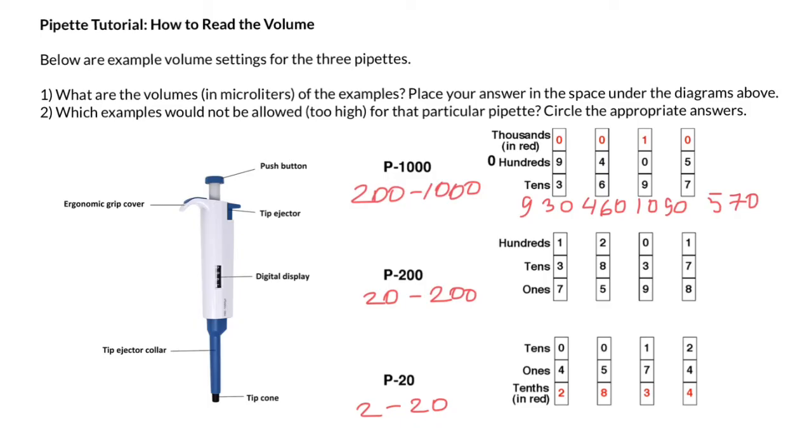And in order to answer the second question, we have to refer to this range or to the name of the micropipette itself. So we can measure with this micropipette only between 200 and 1000 microliters. So that means that this reading here is set too high. So we circle this one, that this is not appropriate setting for this micropipette.